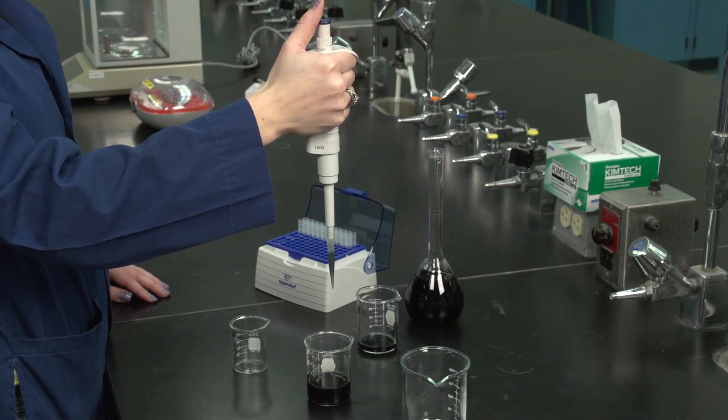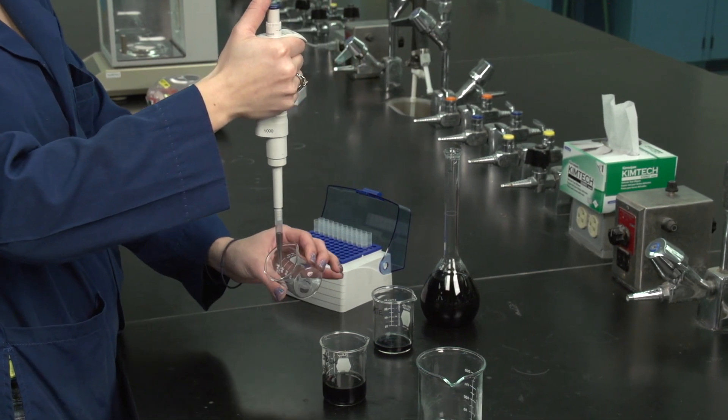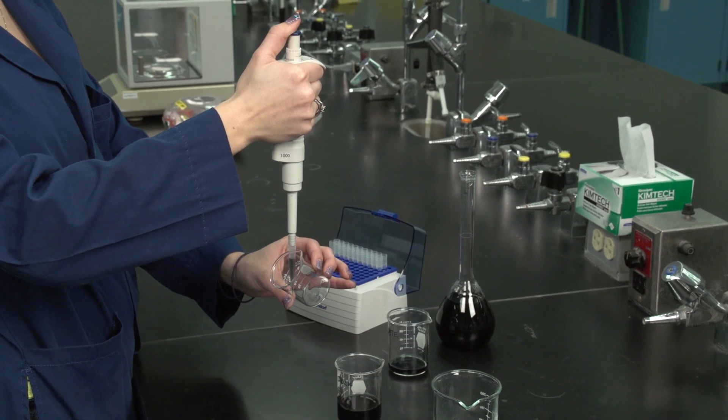Holding the pipette vertically, tilt the receiving vessel and dispense the liquid down the inner wall by pressing the plunger slowly to the first stop.